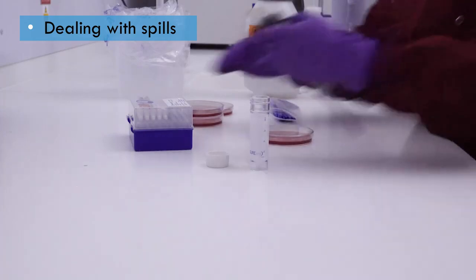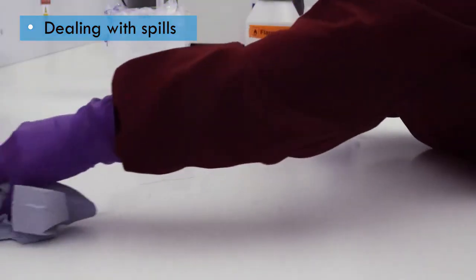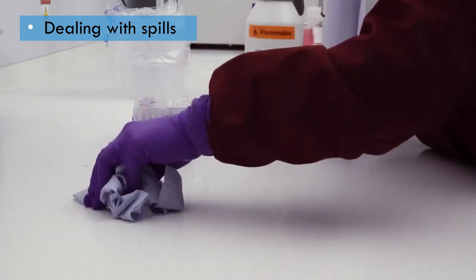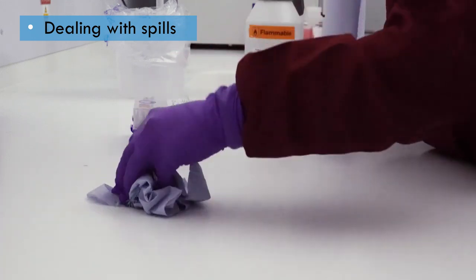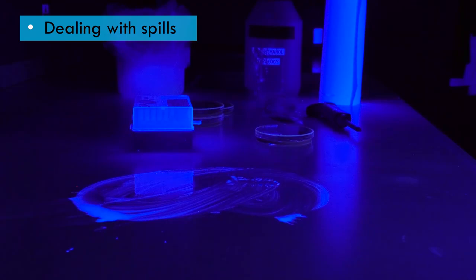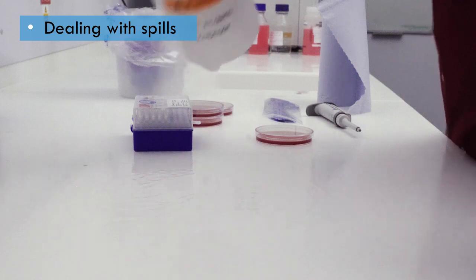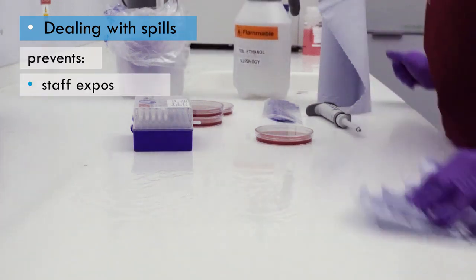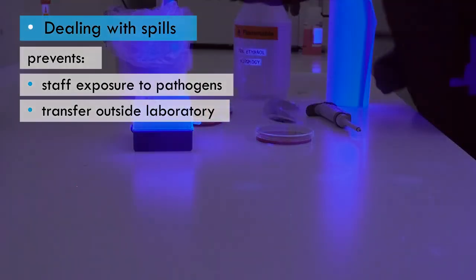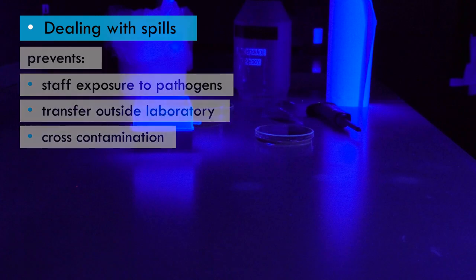It's important that people know how to clean up a spill safely and effectively. The initial mopping up must be done slowly and carefully, working inwards from the edges of the spill to avoid dispersing the liquid over a wider area. There will always be some contamination left on the surface, which will need to be cleaned using an appropriate disinfectant. Working like this should ensure that you prevent staff being exposed to the spilled biological agents, transfer of the biological agents outside the laboratory, and cross-contamination of samples.